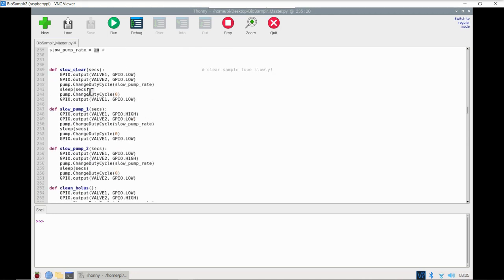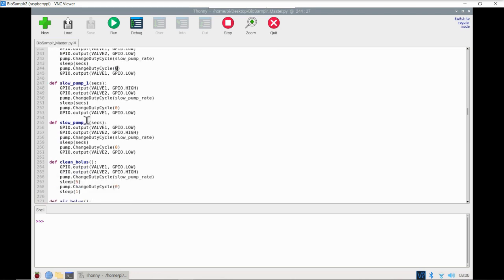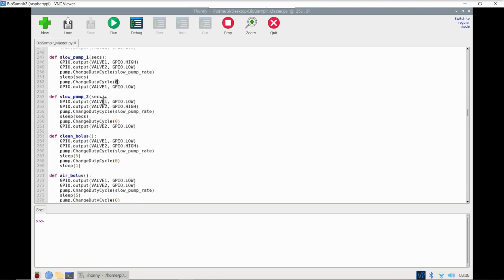Next, these pump and valve functions. Slow clear is going to clear the sample tubing using air — it sets the valves in the correct positions to move air through the tubing for a designated number of seconds, then turns off the pump. Slow pump one and two pump fluids from different locations for a desired number of seconds. Slow pump one energizes valve one high, pulling fluid from the source or bioreactor. Slow pump two has valve one low and valve two high, pulling fluid from the cleaning solution.